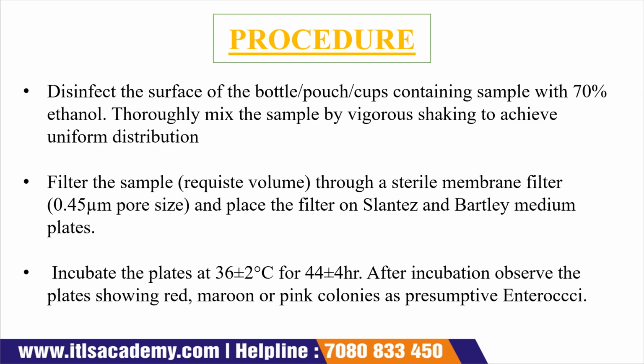In the procedure, what do we have to do? We clean the laminar flow, because we perform the experiment inside the laminar. The laminar will be cleaned with the help of 70% ethanol. Then we switch on the UV light for 15 minutes, so that if any microorganisms are there, they will be killed. How we do it, you can check the video related to this. The video is already uploaded in our account.